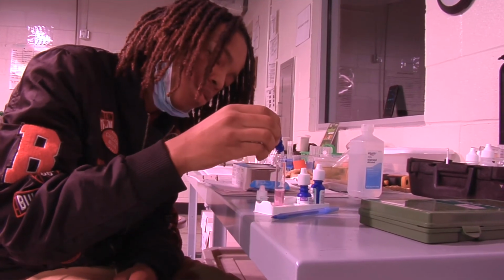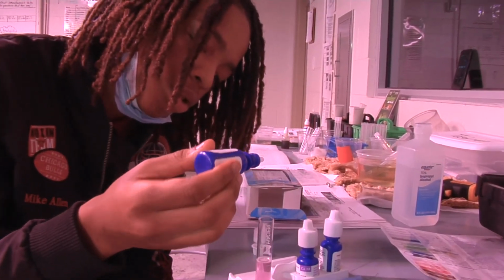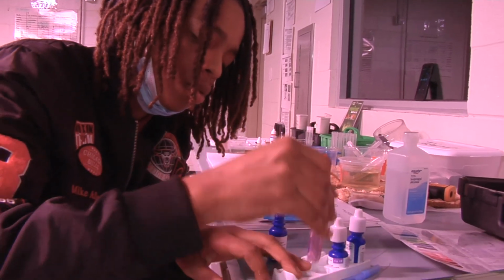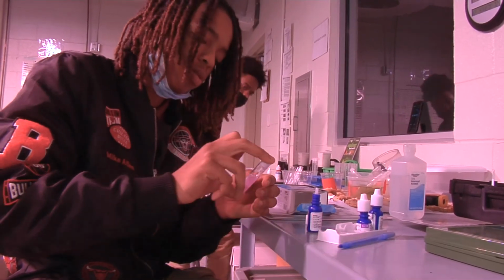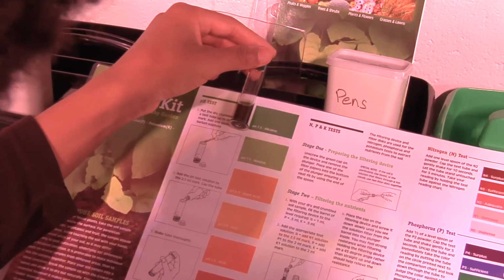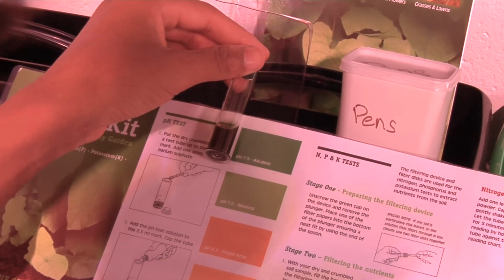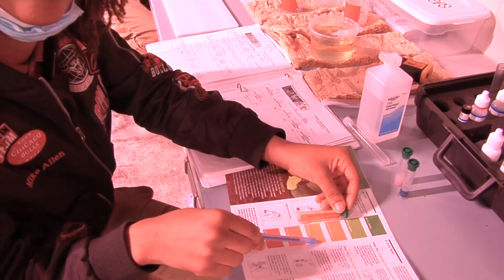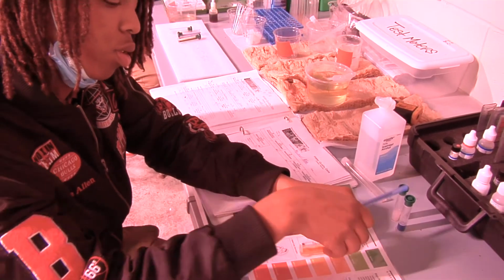So remember, you're looking for that kind of pinkish color. Oh, actually a purple color. You shake it after every drop? Yeah. All right, hold it. Keep holding about 3 more seconds. 2. Okay. What do you think it is?